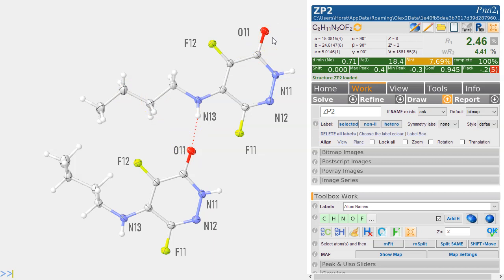It's consistently labeled and named. However, of course now these atom names have become longer. They've got the residue number with it. That really does lose a little bit of flexibility and makes the tables a bit more ugly. For this kind of work, I'm not so sure whether the resi is the way to go, and the other tools of naming things as I showed earlier are probably quite adequate to deal with these kind of structures.